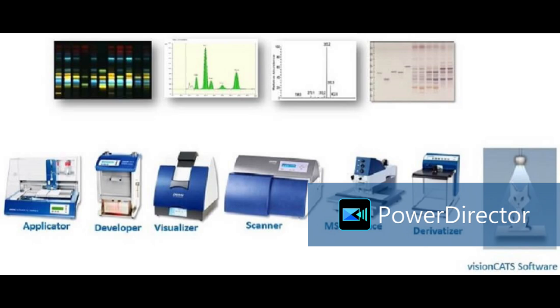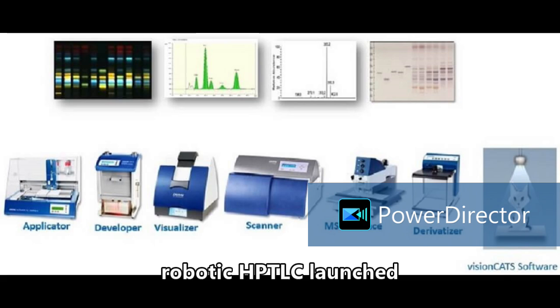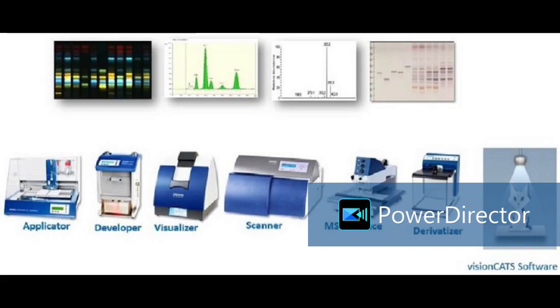So how to do HPTLC with standard protocols, by controlling all the technical parameters in depth. And in 2018, many pharmacopoeias across the world, like US Pharmacopoeia, Chinese Pharmacopoeia, Japanese Pharmacopoeia, European Pharmacopoeia accepted HPTLC. Then in 2022, Camag launched robotic HPTLC, meaning without any manual intervention. Right now, how we are doing HPTLC, just taking the plate from one module to another manually through our hands. But it is now completely robotic with the HPTLC Pro setup. That also we can see in our facility.